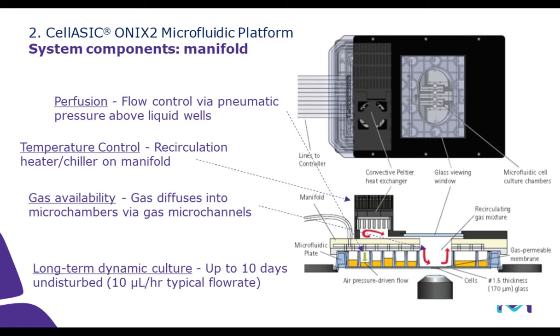Once you're happy with the loading results, you can then set up the treatment time, the gas, and temperature on the ONIX software. Place the plate on the microscope and use your microscope software to set up capturing intervals, autofocusing, setting up beacons, etc. And then press Start on the ONIX system, and also press Start on the microscope capture button.